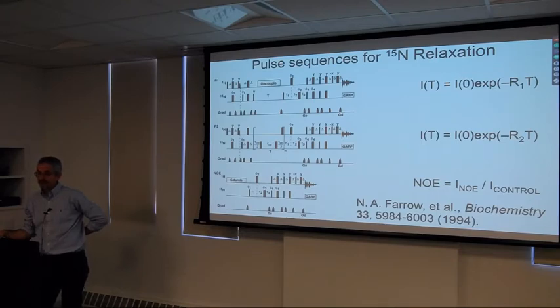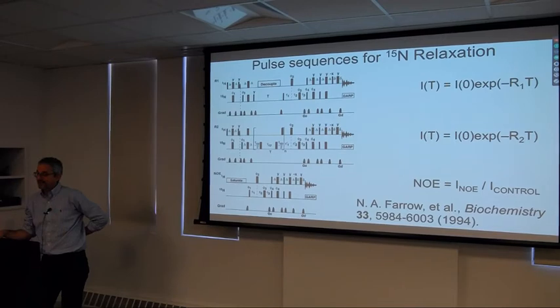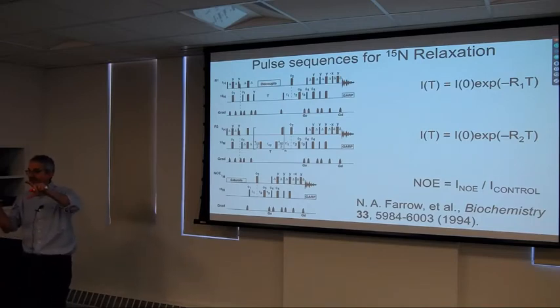And those 180-degree pulses, by periodically flipping alpha to beta, you'll remember hopefully from a problem set that a 180-degree pulse changes I alpha to I beta and I beta to I alpha. So the pulses are averaging I alpha and I beta, so the different relaxation rate constants across those transitions get averaged, so that we lose this cross-correlated effect, which also would render magnetization decay bi-exponential.